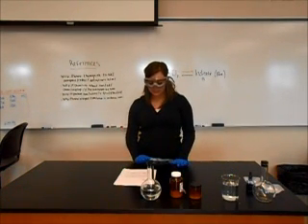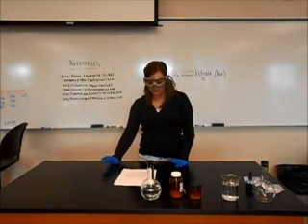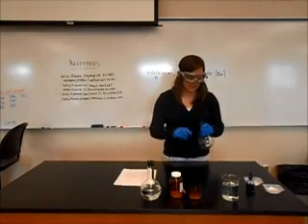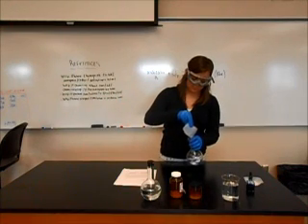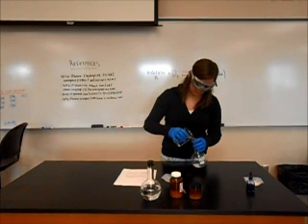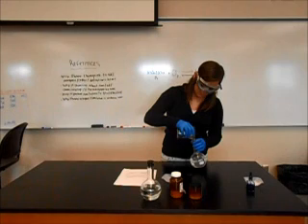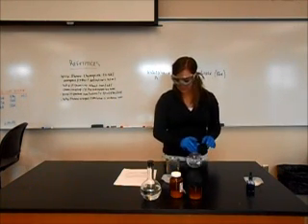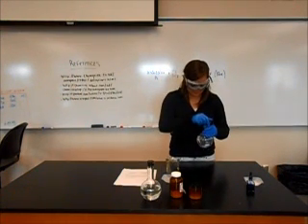And the first step you do is you dissolve 8 grams of the potassium hydroxide in 300 milliliters of water, and you do that inside the 500 milliliter Florence flask. And then just shake it to dissolve it. And then next you're going to add your 10 grams of dextrose to it.